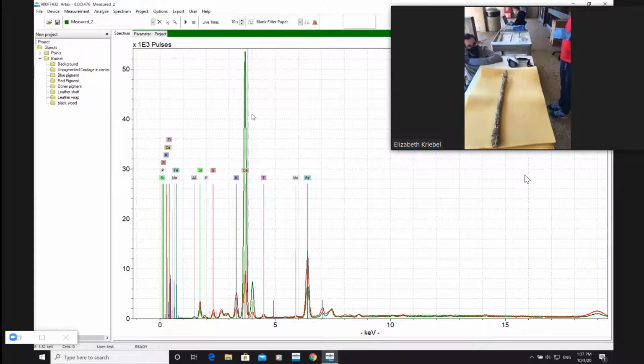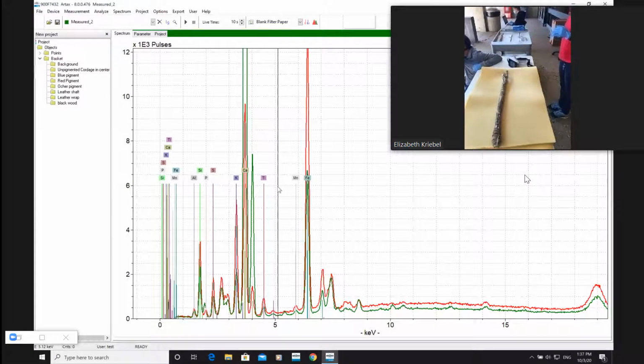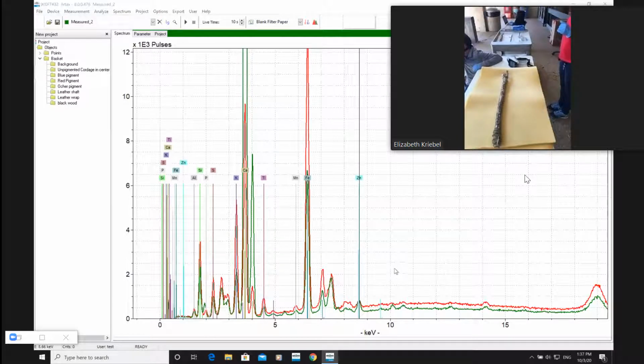So this whole thing might have been plastered over maybe, and because it crumbles, you just have splotches left. So you think the iron we saw on the wood is just some residue from plaster that used to be there? Or it was repainted or something. I do see zinc in this guy too, which is unusual. A little more lead in this. The zinc is a bit of a tell that the plaster is not old. But yeah, no, it's some kind of plaster.